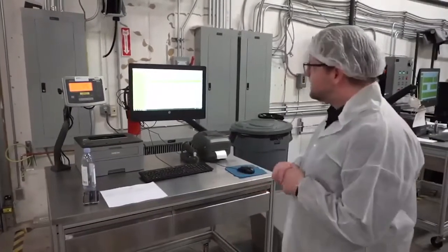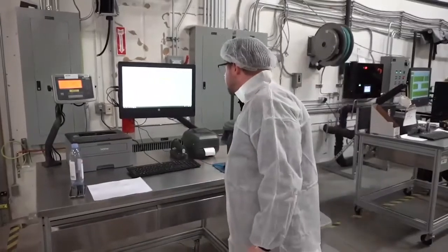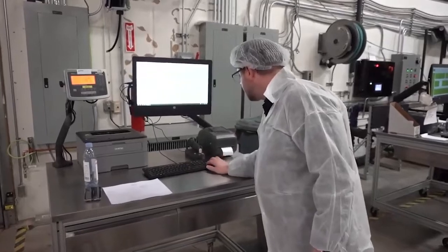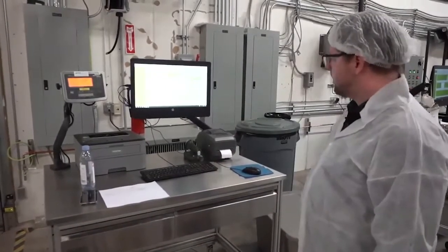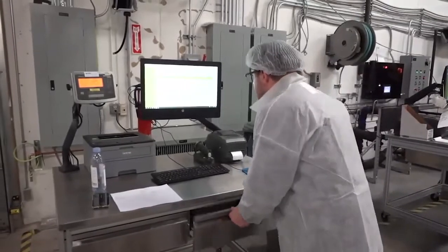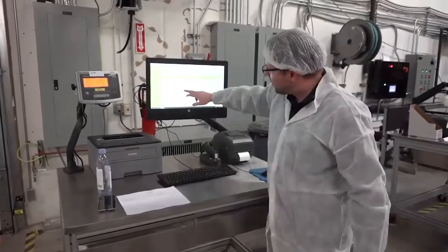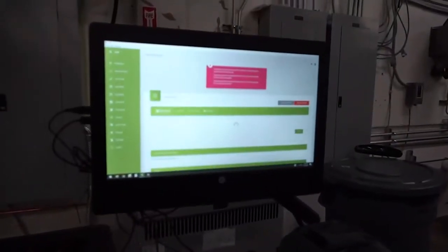It has a sampling station, so if I switch my station over to a sampling station, I log back in. This is typically a sample lot, and you can see these are all current processes that are pending. In other words, there's people who are waiting for their samples.